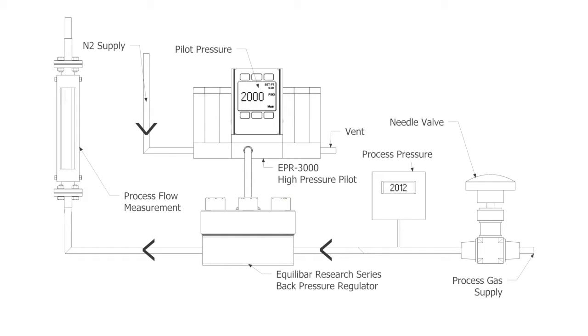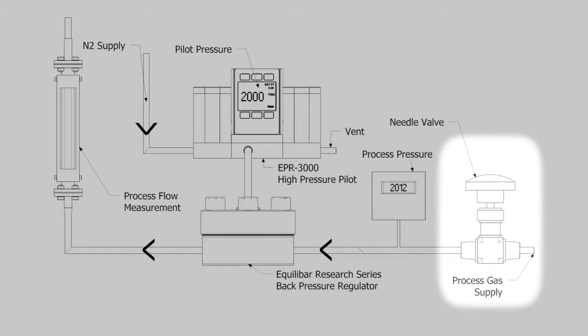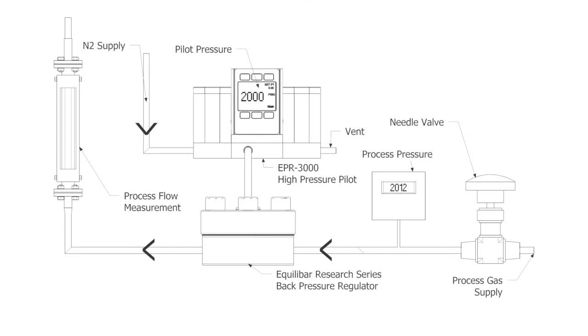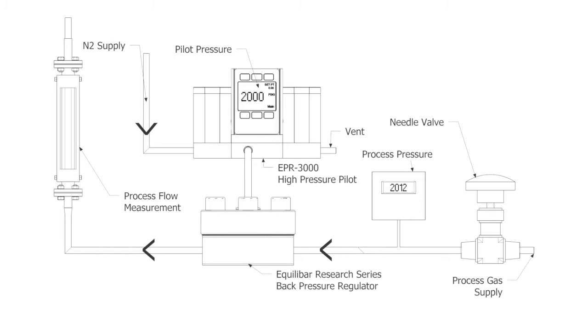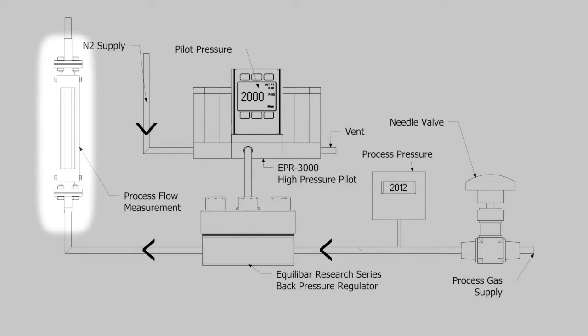In this video, we will use a separate nitrogen supply to simulate chemical process gases. We will use a needle valve to simulate varying flow rates coming from a research reactor. The process pressure is measured by a WIKA pressure sensor, and the process gas flow rate is visualized by a bank of rotometers.